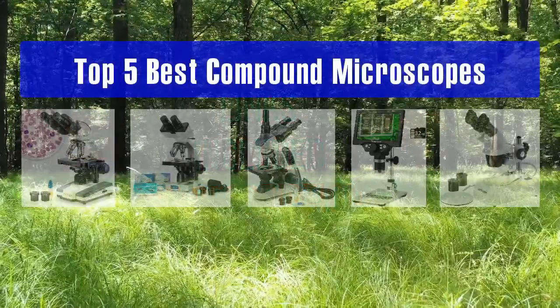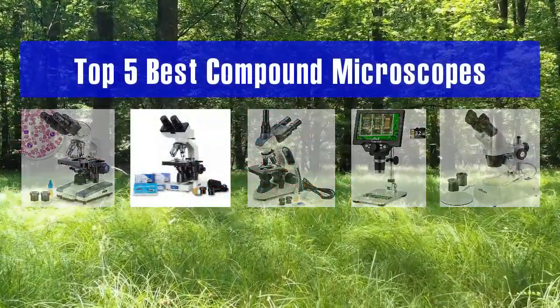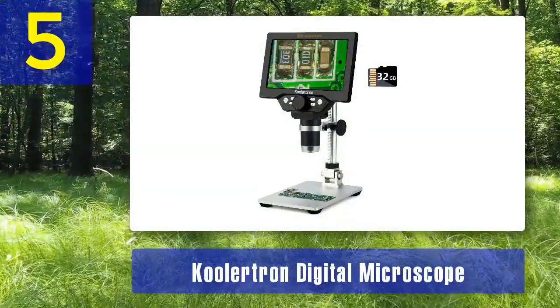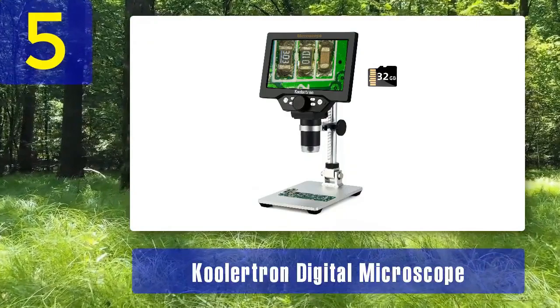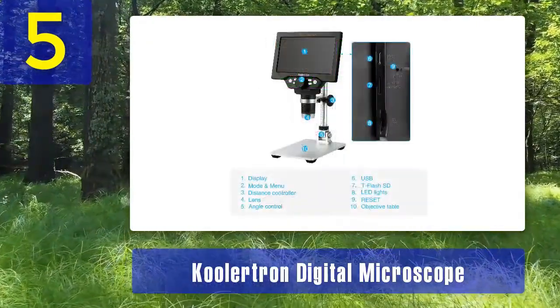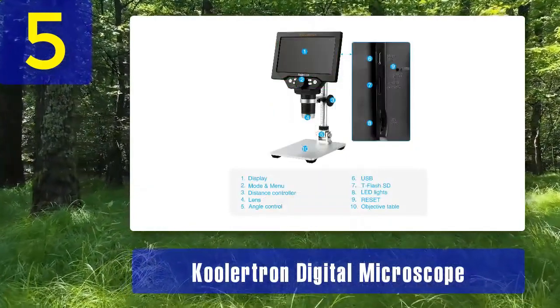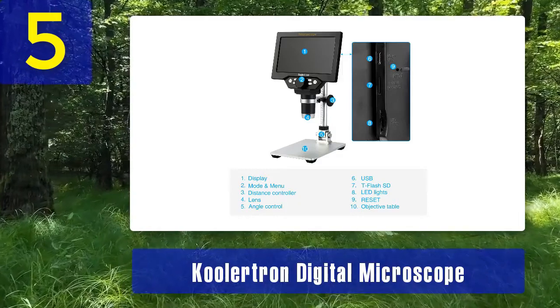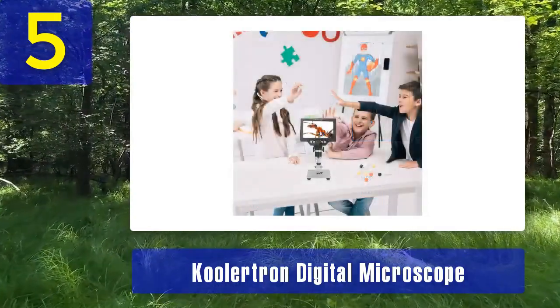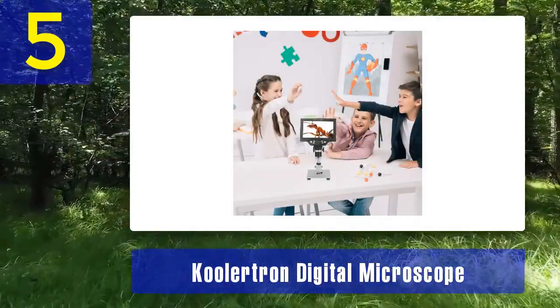Number 5: Coolatron Digital Microscope. The Coolatron Digital Microscope is a modern and versatile microscope that combines traditional optics with digital imaging capabilities. It features a compact and portable design, making it suitable for both fieldwork and lab use. This microscope offers magnification options ranging from 20 times to 300 times, and its built-in camera allows for real-time observation and image capture.